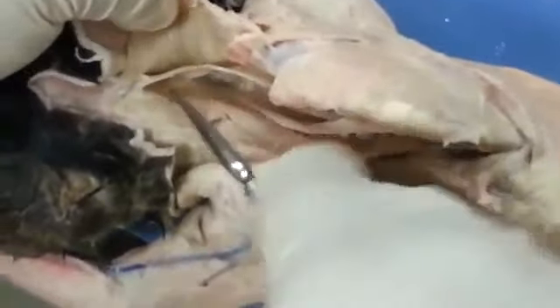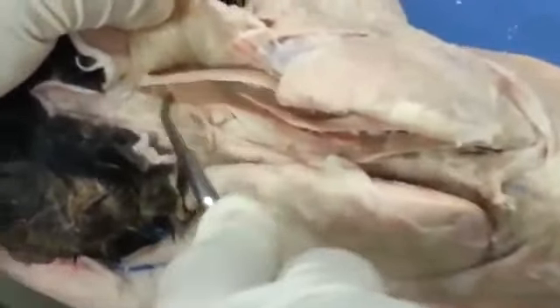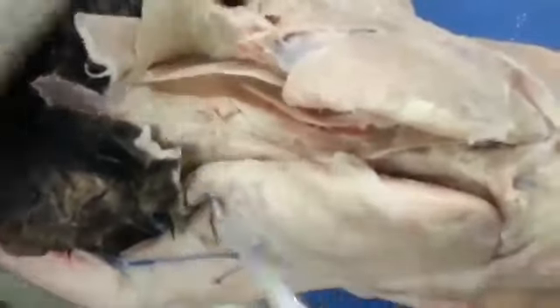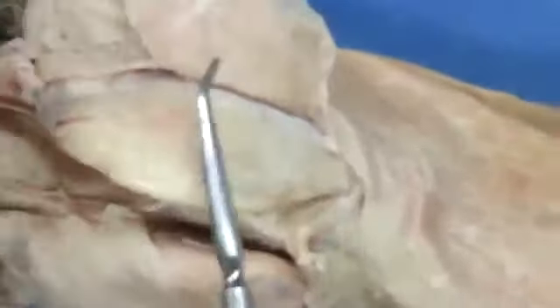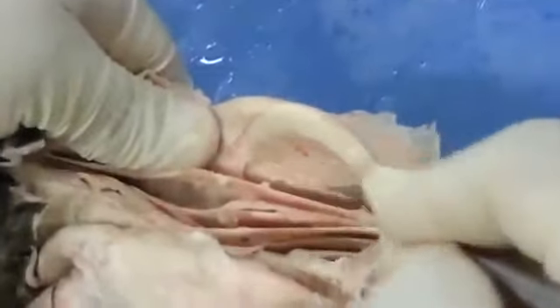And then deep to that, you have the splenius. Right, the splenius, which is going to also extend the neck along with the clavotrapezius. The deep muscle to the acromiotrapezius is going to be the supraspinatus. And then from this angle, now we're under the scapula, you see the subscapularis.